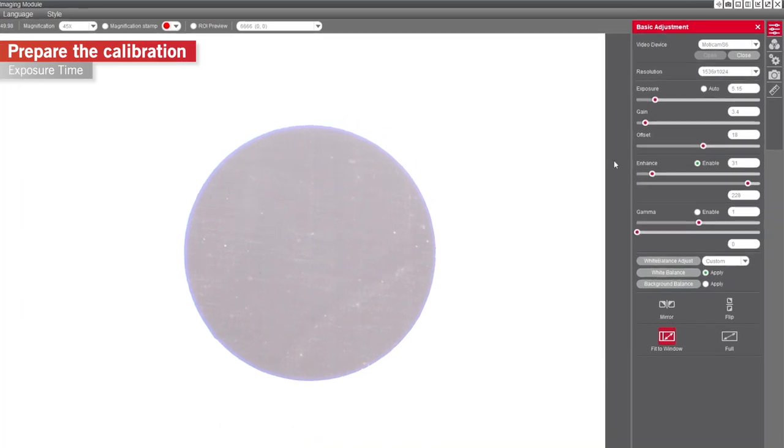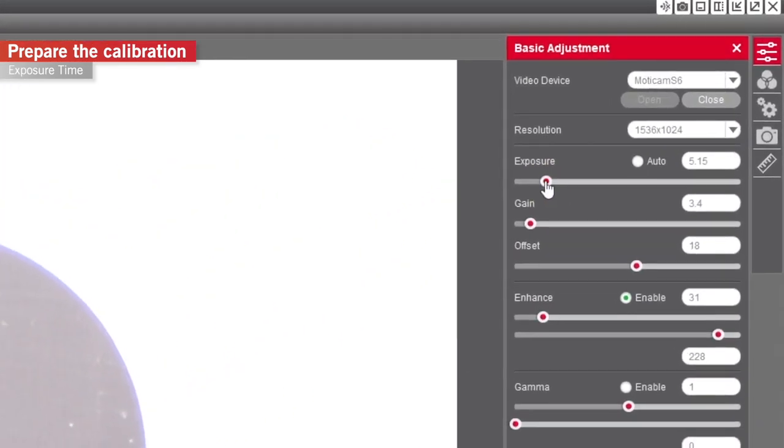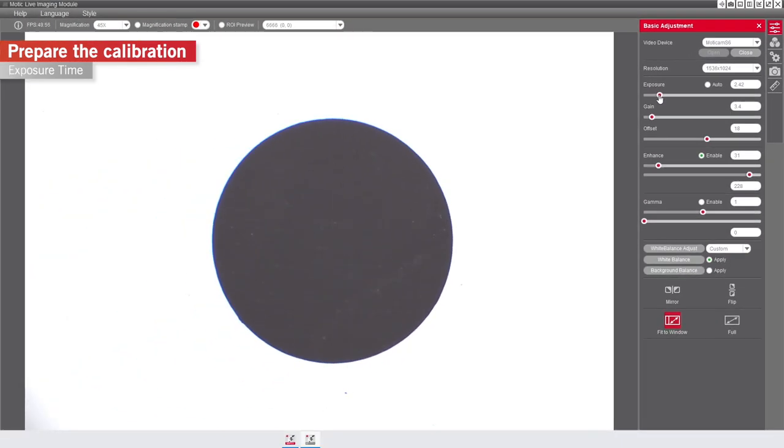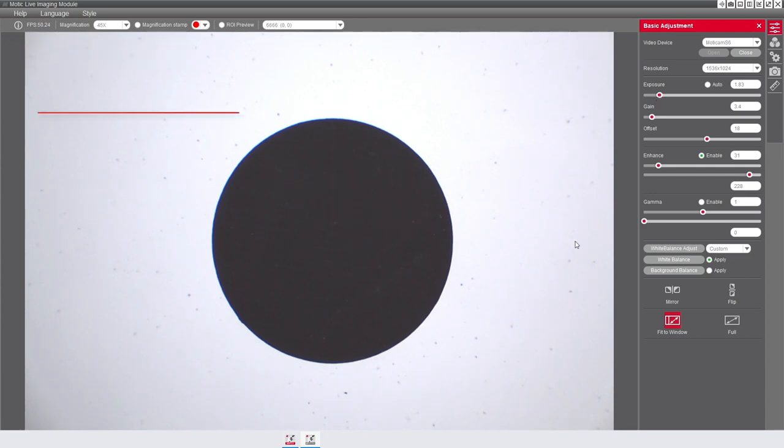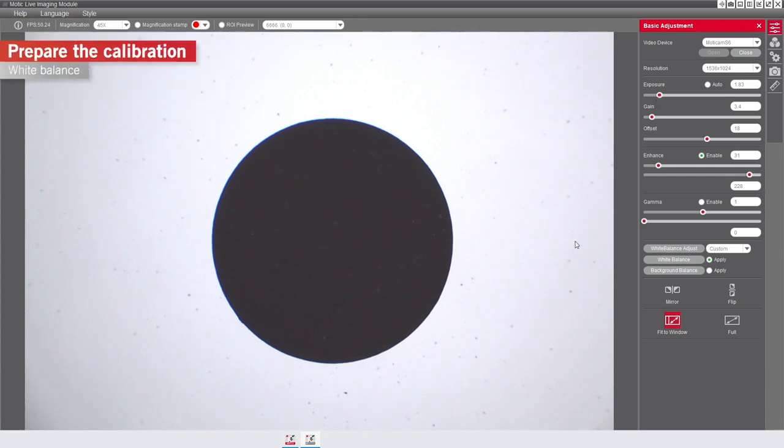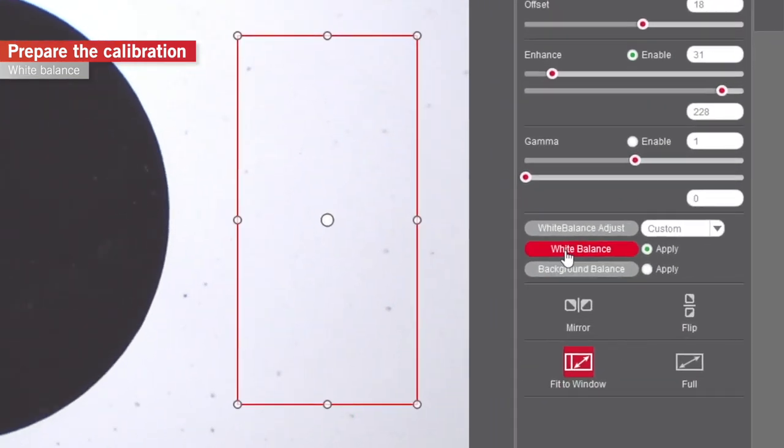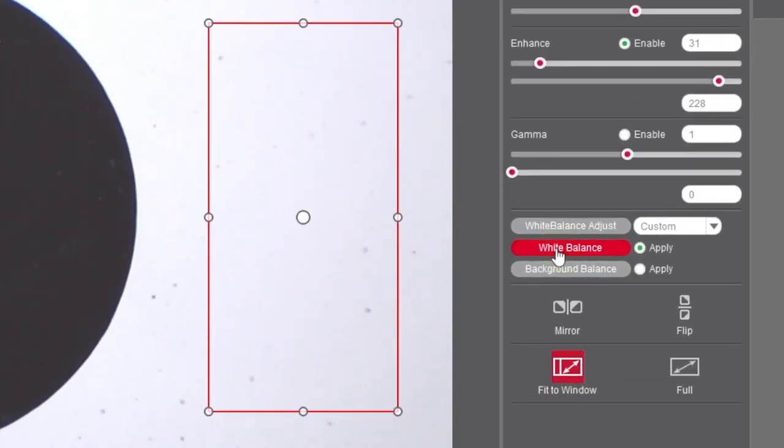Secondly, adjust the exposure time manually until the black dot is clearly contrasted to the background. Go ahead with the setting of the white balance to ensure maximum contrast between the dot and the background. Select a white non-color area by using the left mouse button and click on the second white balance tab.